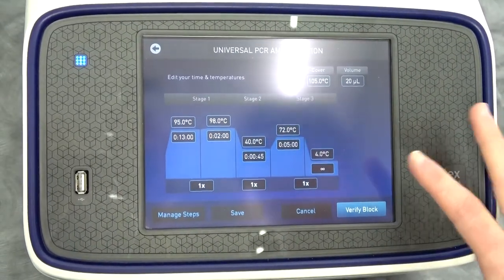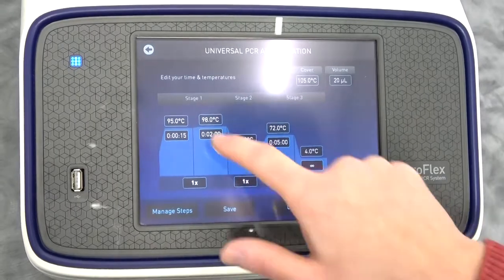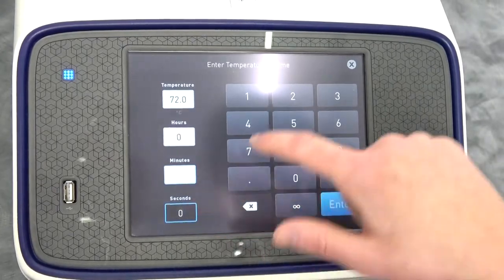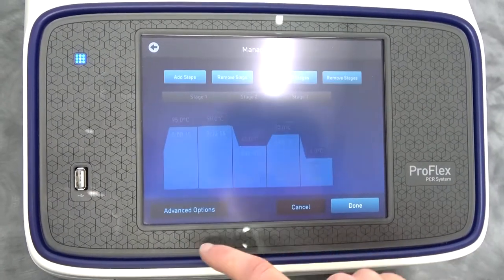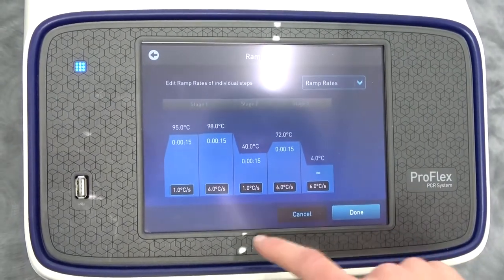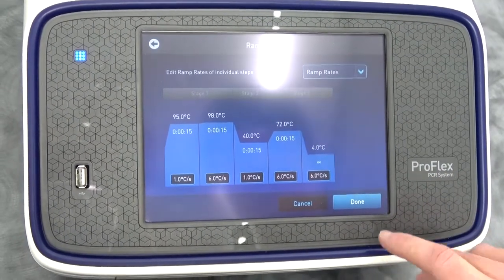I'm going to set up a really short run so you can see it operate. I'm going to move all the steps to about 15 seconds so we can see this instrument actually do something. We'll also change the ramp rate on one of these steps so we can see how it changes. Let's see how quickly it can cool down — it's going to cool down to 4°C, which I'm not sure how it's going to achieve that; that might just be its minimum setting at 6°C per second.